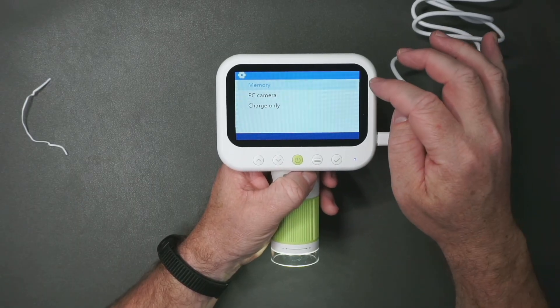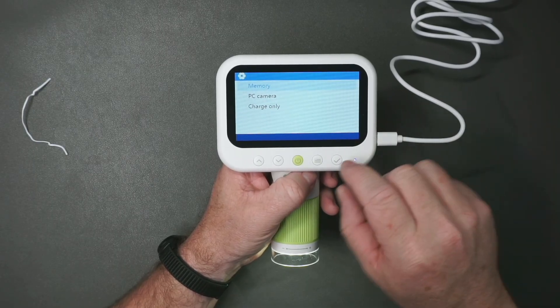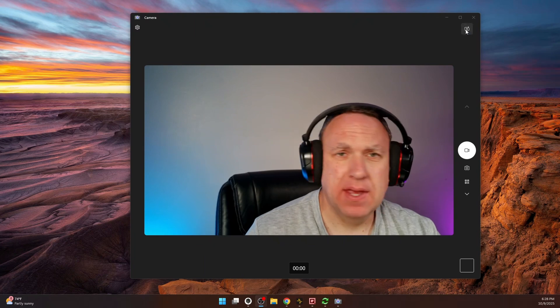When it's plugged into the computer you can do memory — it reads from the SD card — or use it like a webcam, or just charge the device. What we want to do is PC camera mode. Let's open up the camera app on the computer. By default it opens my webcam, so let's cycle through — there we go — digital microscope. Let's maximize this. See how long it takes you to guess what this is. This is a dime, but it's zoomed in so far — that's crazy. Let's try something else. Any guesses? This is a $2 bill. T-E-N. Are there any secret hidden messages that aren't microscopic?